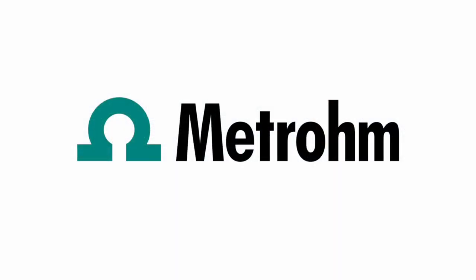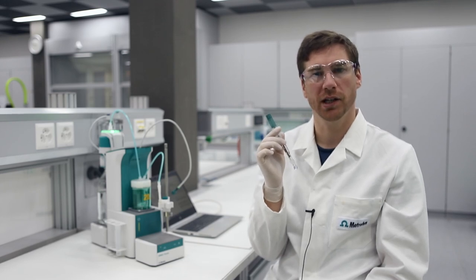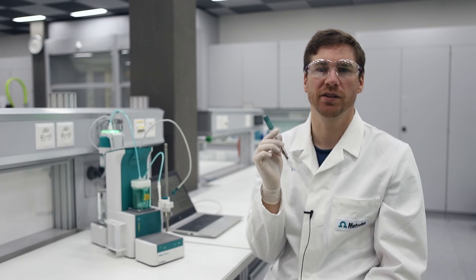Your results depend very much on your electrode and how you handle it. Correct cleaning of your electrode is very important, so let's have a look at the most important points regarding cleaning.